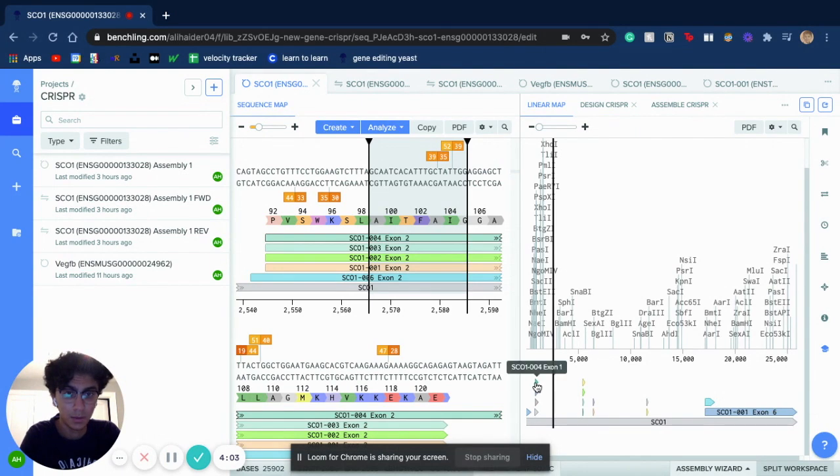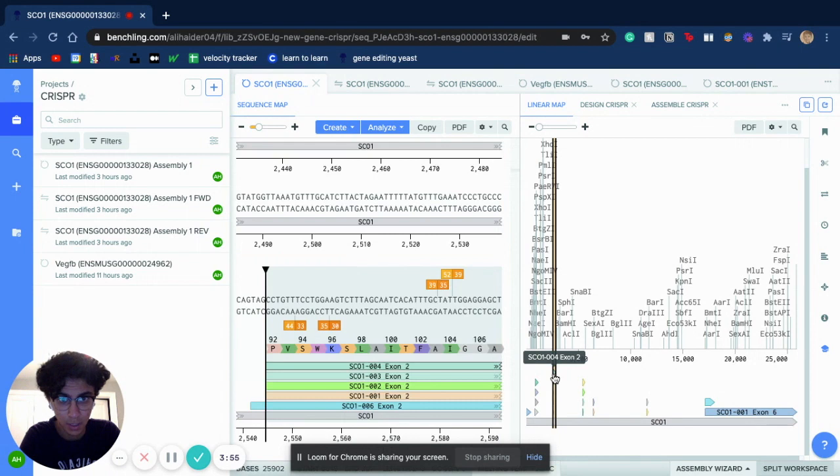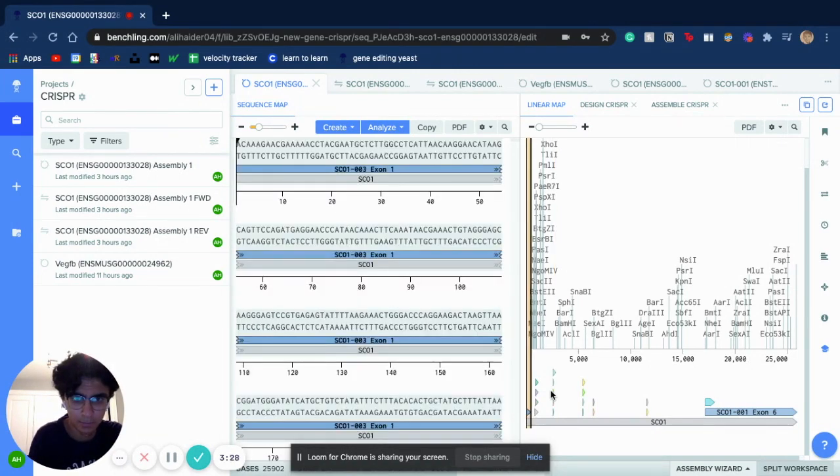When looking at the exons, we can see that we have four right here earlier on in the gene. But I chose to focus on this exon, because it comes after these four exons, meaning that a change in this exon would result in changes in these exons, which is a lot more meaningful of an experiment, and a lot more meaningful of a single guide RNA that can be used in CRISPR. It's also important to note, the YouTube video talked about that it has to be away from the 5' UTR region, so we couldn't really choose this exon as well.